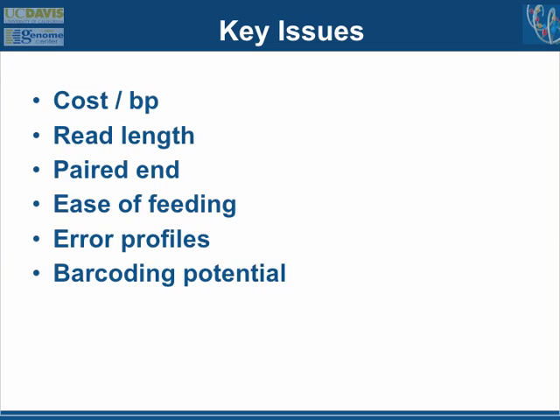Or you can get short cDNA sequences to do a transcriptome sequence if you have a reference genome. But for many purposes, including de novo sequencing of new organisms, sequencing from environmental samples, or trying to construct haplotype structures, longer reads are really beneficial. So the read length is really important for the uses of the sequencing technology.